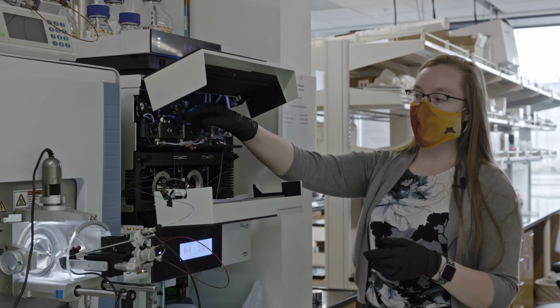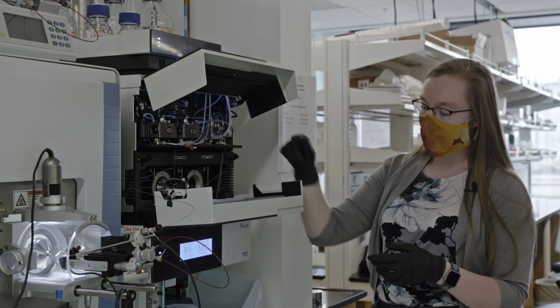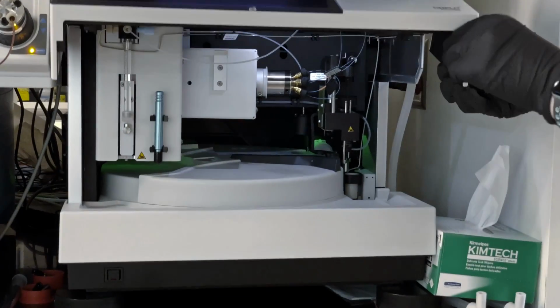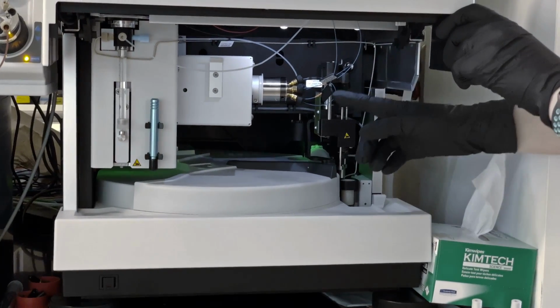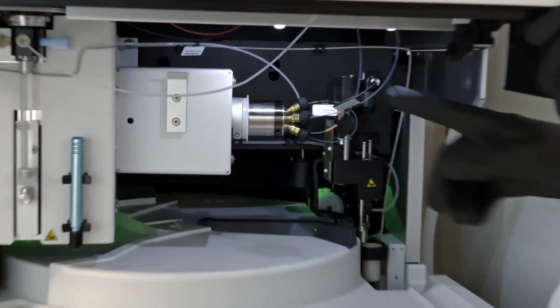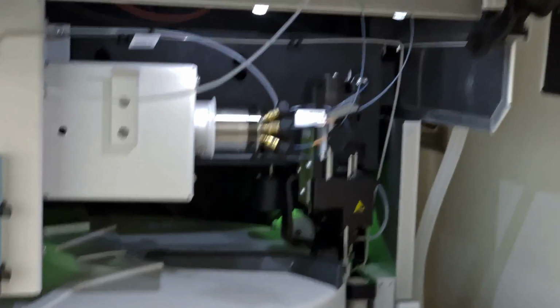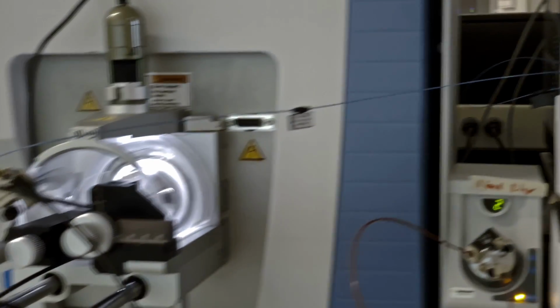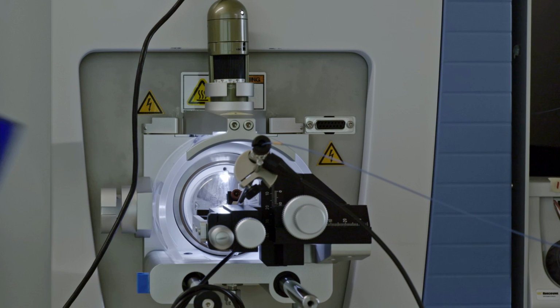So this line runs directly from the pump down to a valve in the auto sampler. And also flowing out of this auto sampler valve is another line that comes up through our column oven and all the way over to our nano source. And that is where we will install your column.